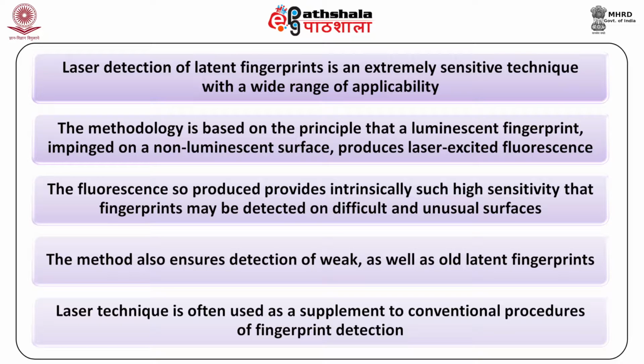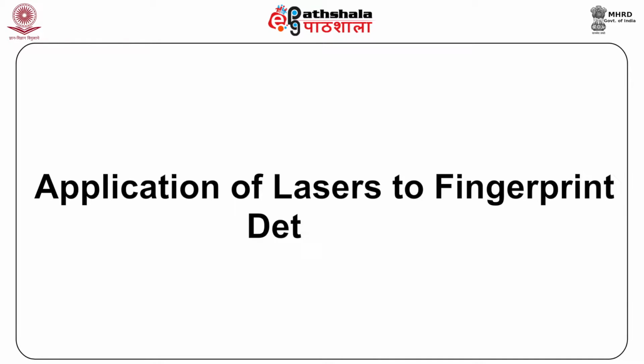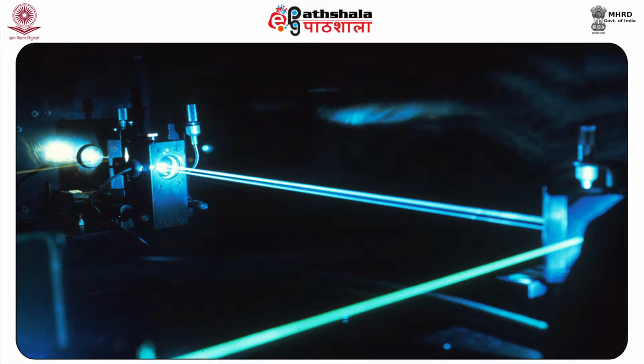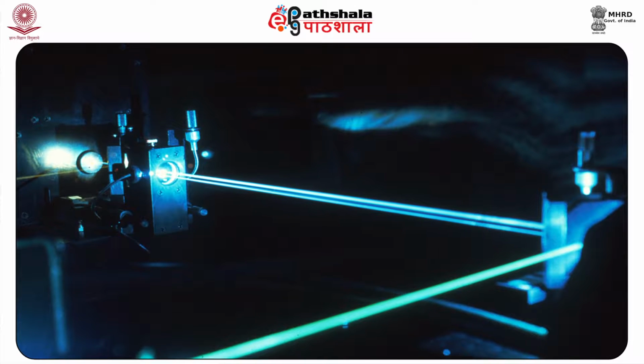The method also ensures detection of weak as well as old latent fingerprints. Laser technique is often used as a supplement to conventional procedures of fingerprint detection. Let us now have a look at the application of lasers to fingerprint detection. The most common device used for the detection of latent fingerprints on difficult surfaces is the argon laser.